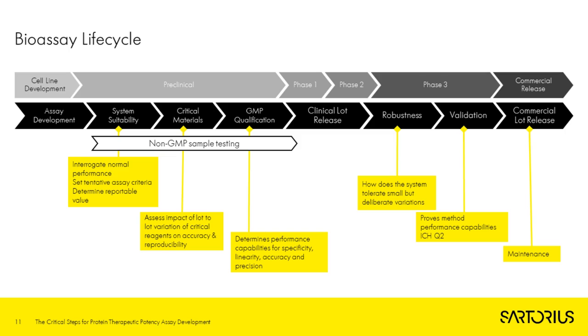And with this bank of data, we can also complete the determination of what we will use as the reportable value and finalise how our data will be combined from assay plates or assay runs. We should also early on assess critical materials.